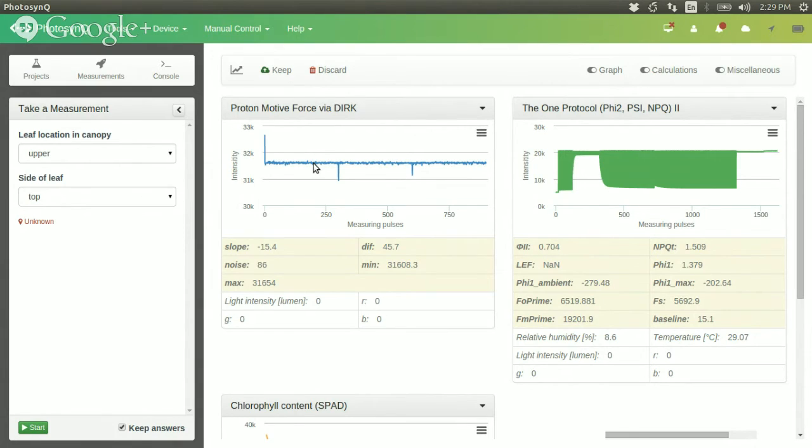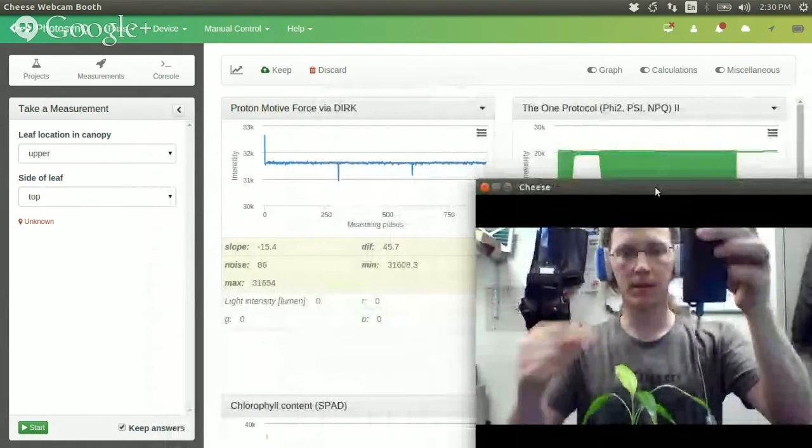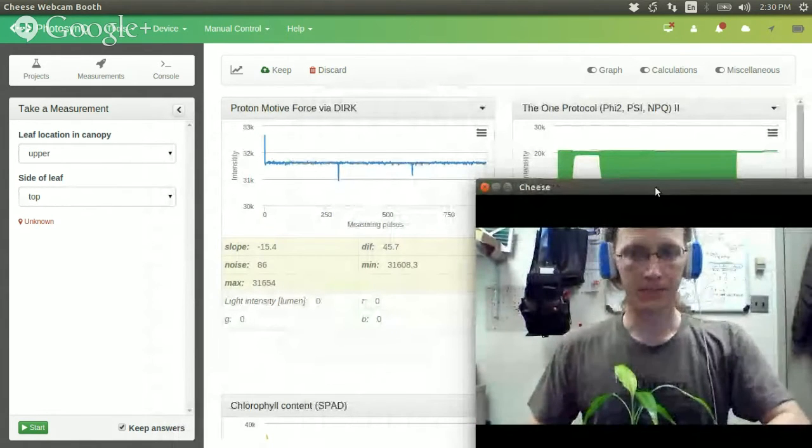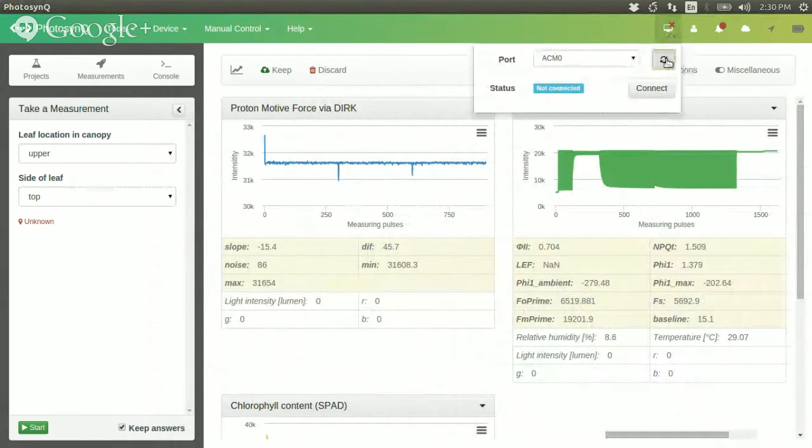So you connect to the device using USB, so you can sort of see what's going on at the same time. Right, I'm connected via USB, and I connect to the device here. It's very simple. MultispeQ ready. So it says, yep, I'm ready to go.